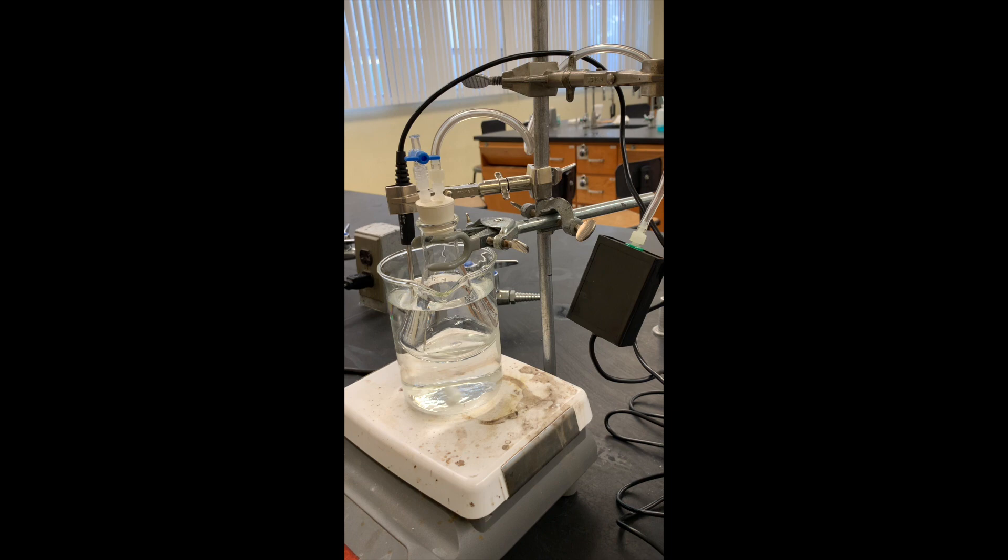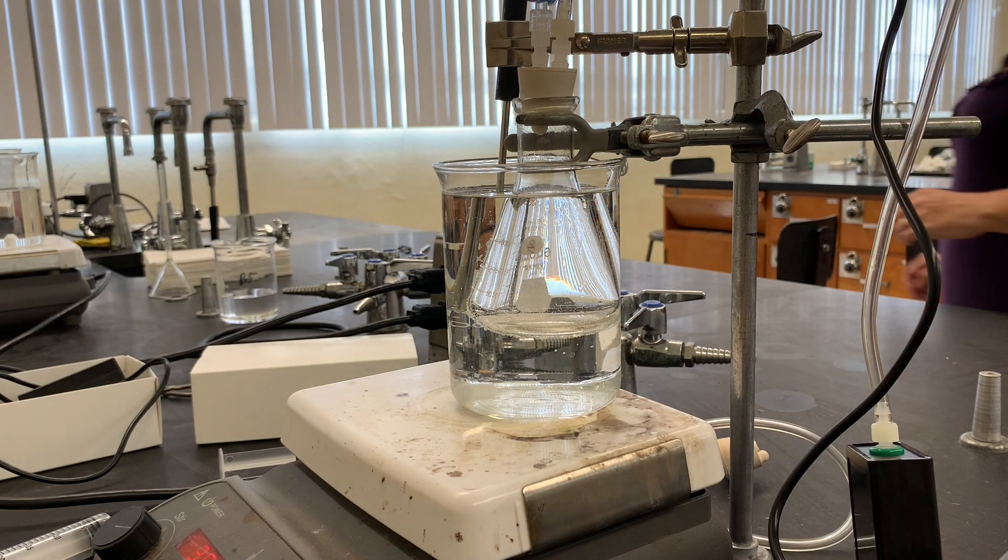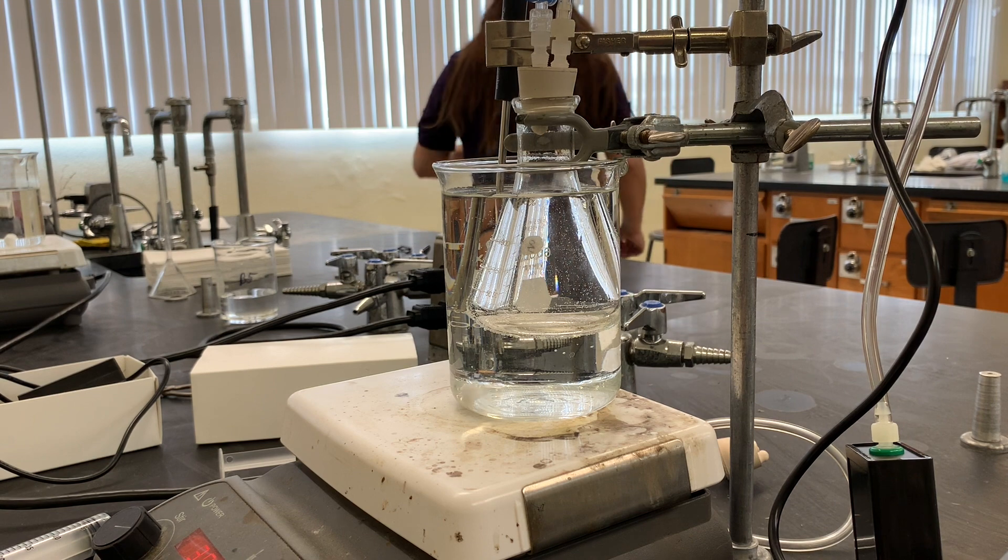I'm going to turn on the heat about three quarters of the way up and increase the stir rate a little bit. The water will heat up, which will heat the methyl alcohol up, and the pressure will increase in the flask. So we will have a temperature versus pressure graph, and after several minutes the pressure builds up.